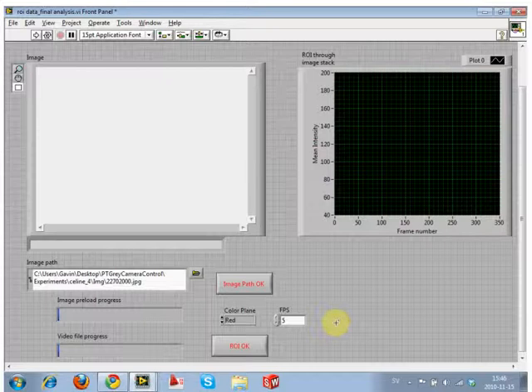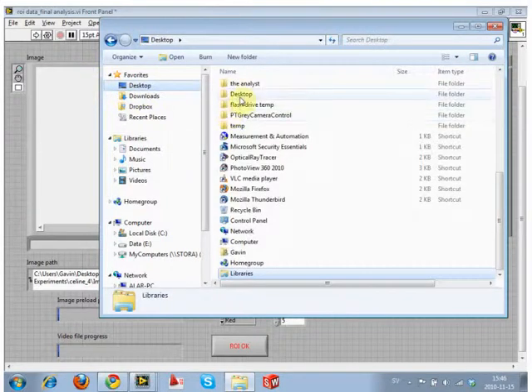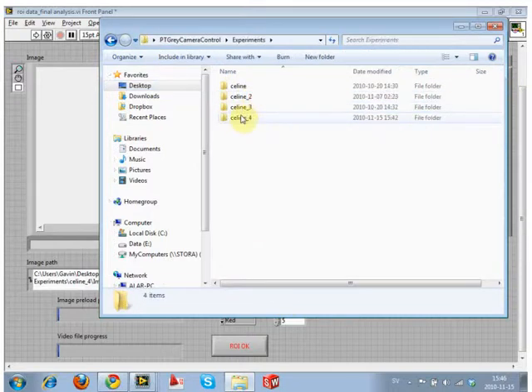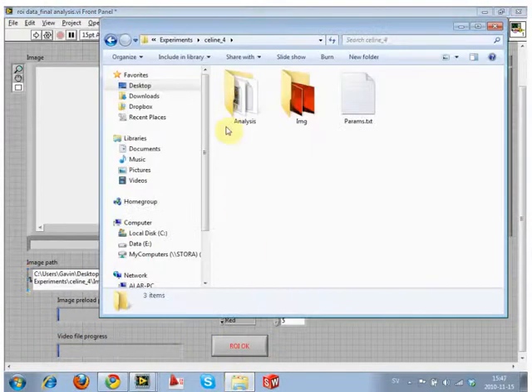But if we just again look at the kind of file structure, the goal for a lot of these programs that are designed to be used a lot for data sets is you want to let the program do the heavy lifting. We don't want to have to type in the image path folder location for all of the images after they're renamed, the location for the data file. We don't want to have like 6 or 7 items for the path name, because it's not necessary. We can essentially infer it by one file path, and then you get your whole file structure from it. So if we go to the back end, that's what we're doing here.